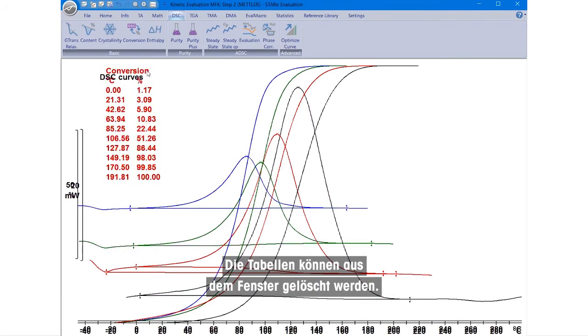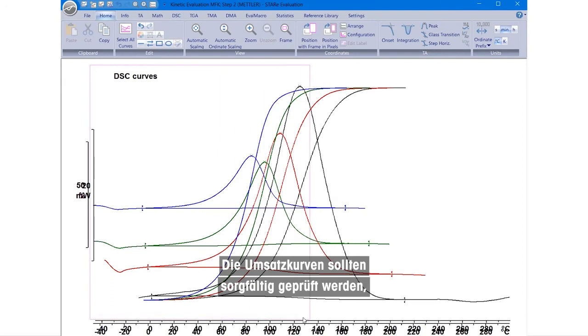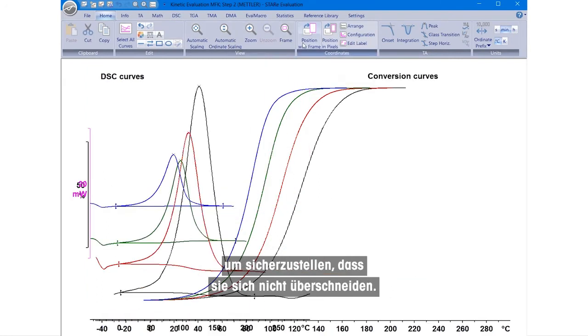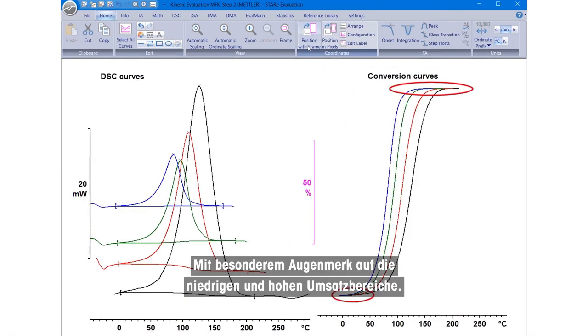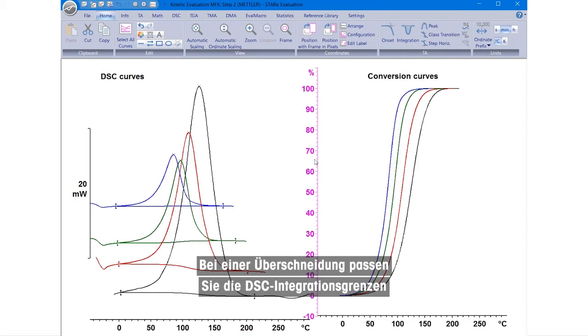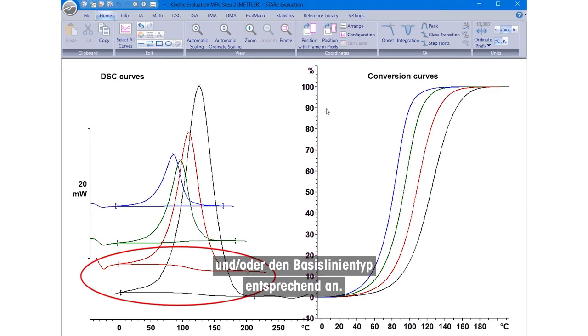The tables can be deleted from the window. The conversion curves should be inspected carefully to make sure they do not cross over each other, paying special attention to the small and high percentage conversion areas. If any crossing over is detected, then adjust the DSC integration limits and or the baseline type accordingly.